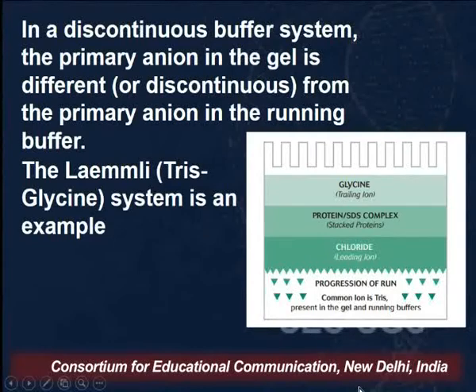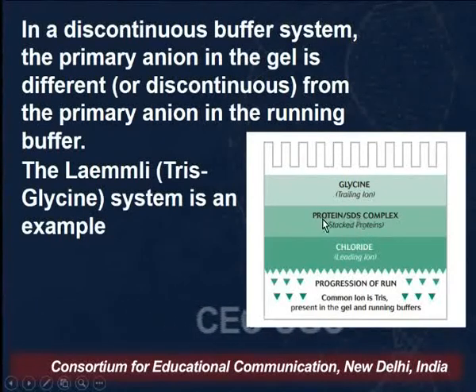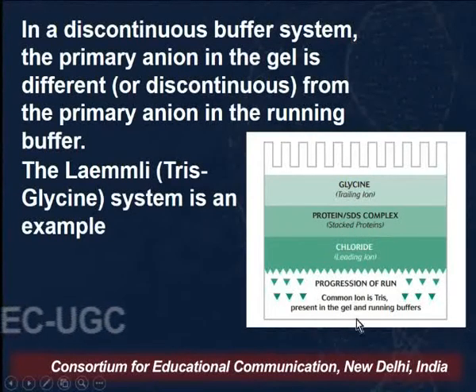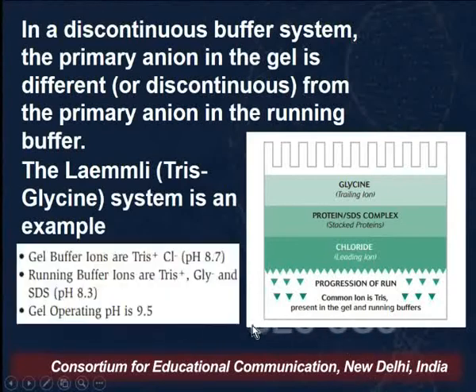and then better resolution as it enters into the resolving gel. This kind of system is termed the discontinuous buffer system, because these different ions encompass or cover the polypeptide chain during the stacking period, and therefore the resolution is better when it comes to the resolving gel.